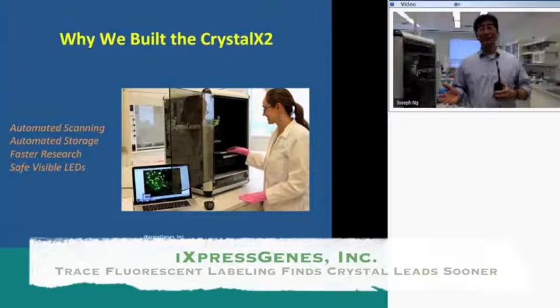And we're a small lab, so we don't have any fancy automated machines other than students with a lot of multi-channel pipetting. So this is the motivation to build this instrument: to find early leads very quickly and efficiently, mainly for us in the beginning. Then, when we actually built the instrument, we thought that this could be usable for the X-ray crystallographic community, for screening, storage, and research.